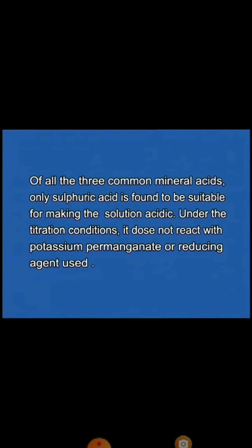Of all the 3 common mineral acids, only sulfuric acid is found to be suitable for making the solution acidic. Here we will learn why we only use sulfuric acid. Under the titration conditions, it does not react with potassium permanganate or the reducing agent used.